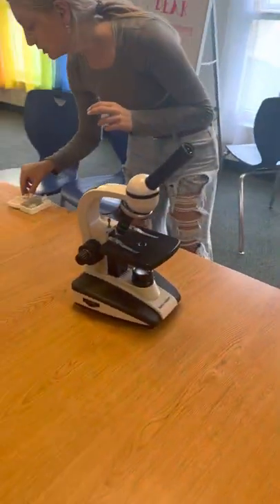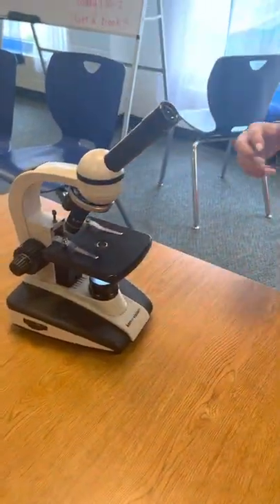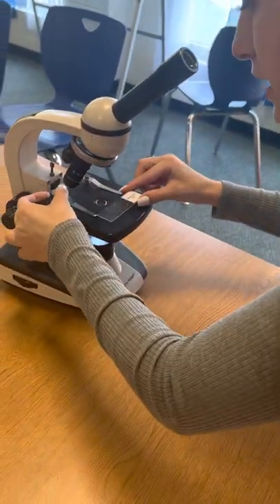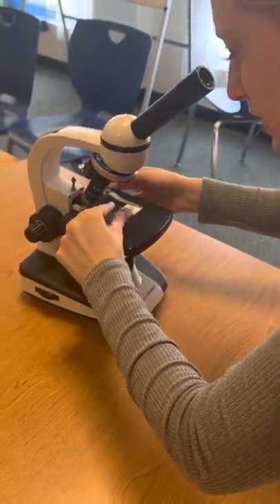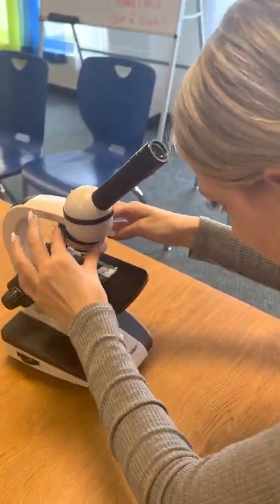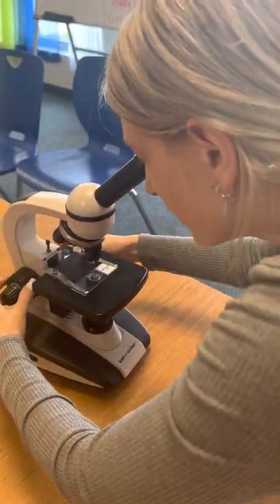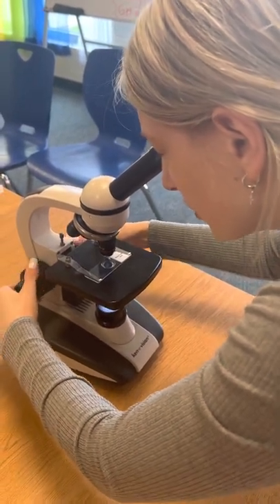I'm going to be using my muscle type slide. I'm going to be showing you a cardiac muscle. I'm going to very gently place my slide underneath my mechanical stage clips. Make sure it's centered. I'm going to use my coarse adjustment knob to get this into focus.